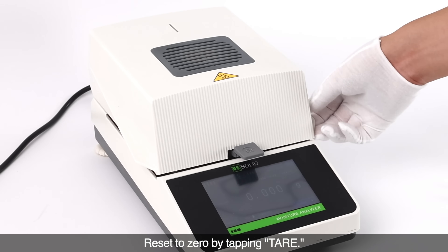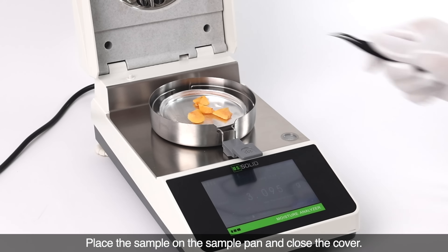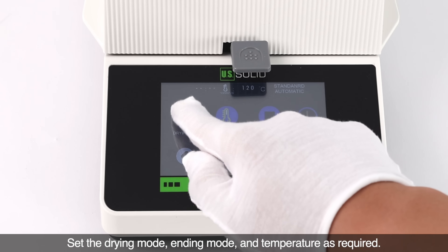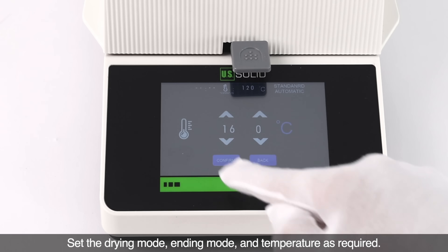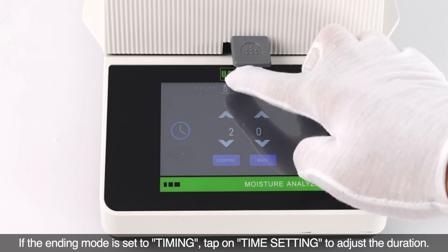Reset to zero by tapping tare. Place the sample on the sample pan and close the cover. Set the drying mode, ending mode, and temperature as required. If the ending mode is set to timing, tap on time setting to adjust the duration.